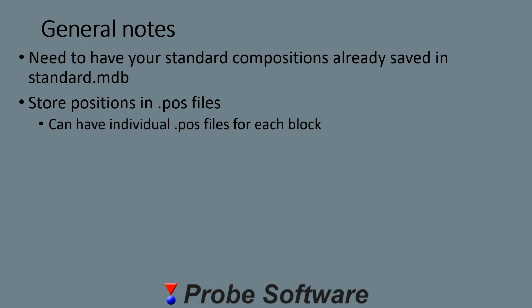We store the positions in .pos files. You can have an individual POS file for each standard block, which makes it useful if you want to unload or reload or move a given standard block. You then don't have to update the entire file.